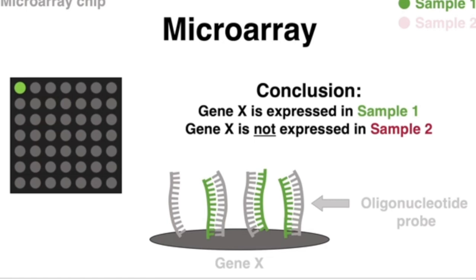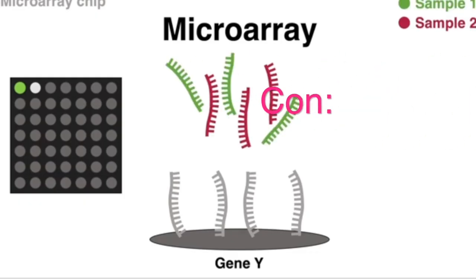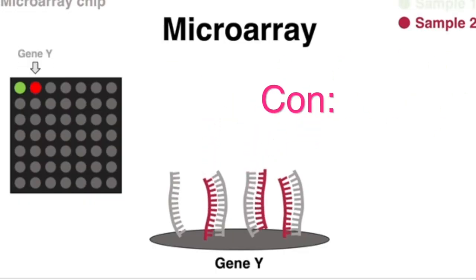So another disadvantage, if you are aware that there are other techniques, is that if you wanted to compare it to RNA sequencing, then you would say this technique has lower sensitivity. And this can be particularly annoying because if there are small differences between two different conditions, like the drug-treated and the non-drug treated, a microarray may not have the sensitivity to pick that up.